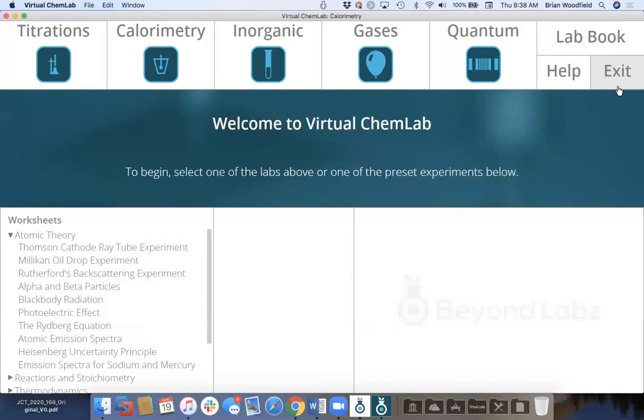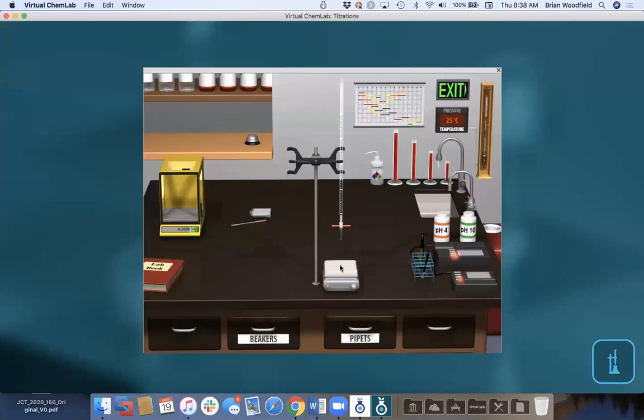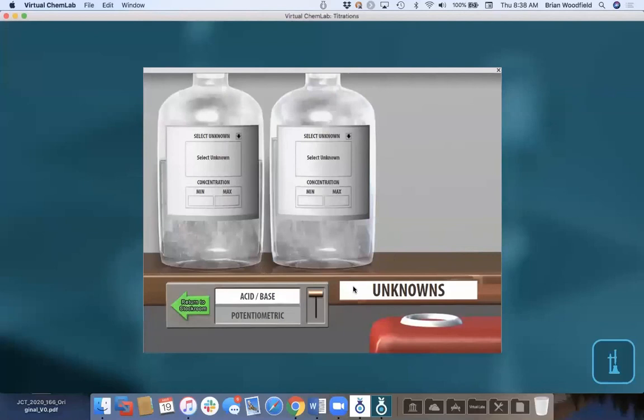But if it was me and I was too lazy to go through all that work, because I don't have the time, what I would do is come over here to my unknown. Let's say you wanted to analyze vinegar, for example. I would come down here to, where is our acetic acid?